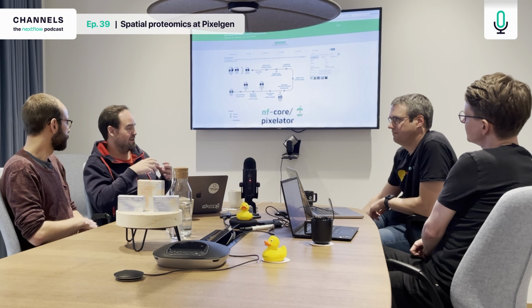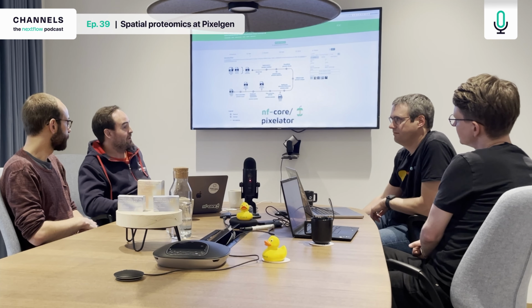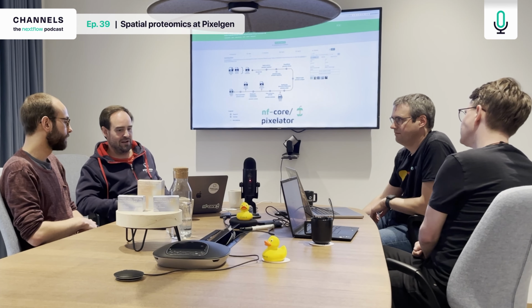Brilliant. But if there is a certain step that doesn't need Pixelator, if there is something out there that could benefit from a better filtration or a better algorithm to calculate the spatial statistics, maybe you want to think about putting a stage somewhere in the pipeline. The formats are open source and very easy to check, so I think contributing a stage should be super simple for anyone in the community.